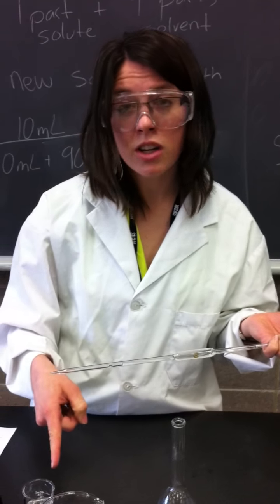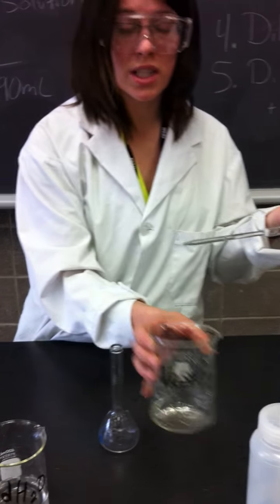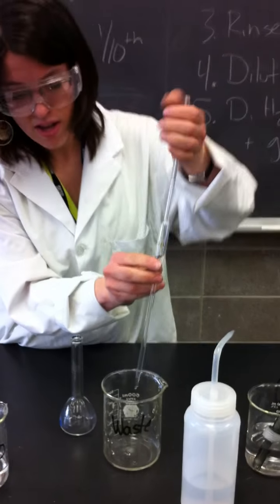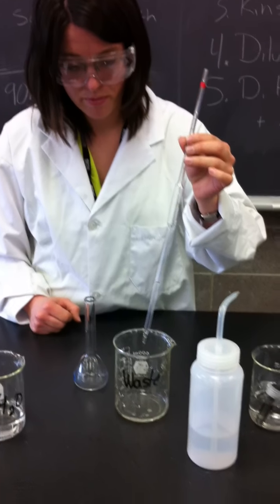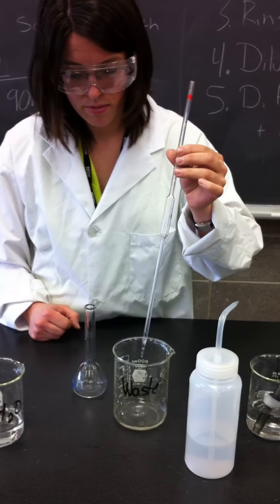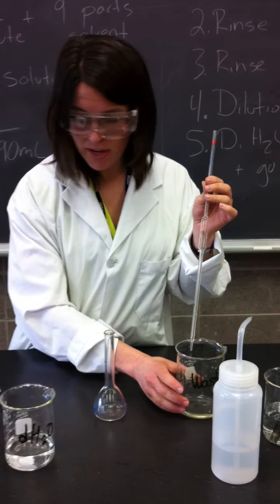Okay, so of course I'm not going to put this stock back into my stock beaker. I'm going to put it into the waste beaker because it could potentially be dirty and diluted with some water. All right, so that's called seasoning the pipette. So now I'm ready for my dilution.